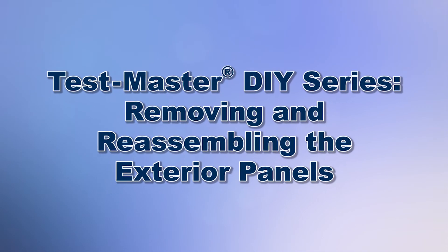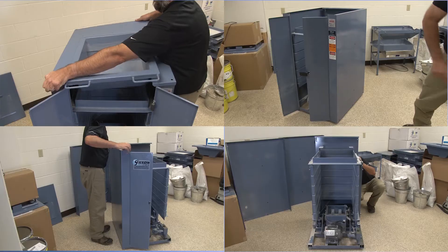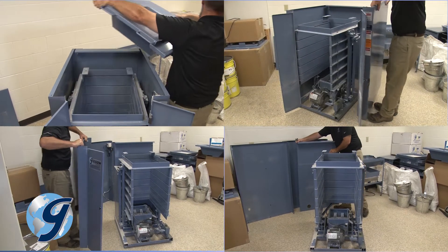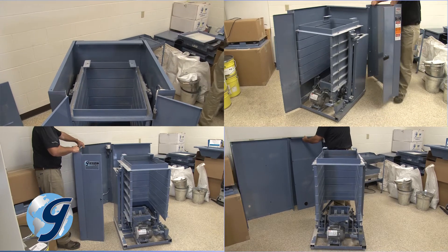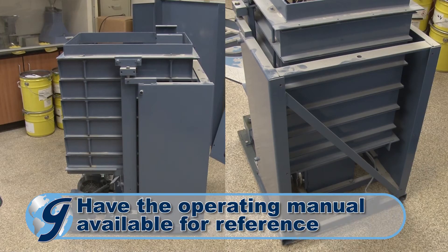Today we'll demonstrate how to remove all the panels from your Gilson Testmaster testing screen. We will remove the top cover with hopper assembly, the right side panel, the left side panel, and finally the rear panel. Then we will demonstrate how to reassemble the Testmaster and its panels.